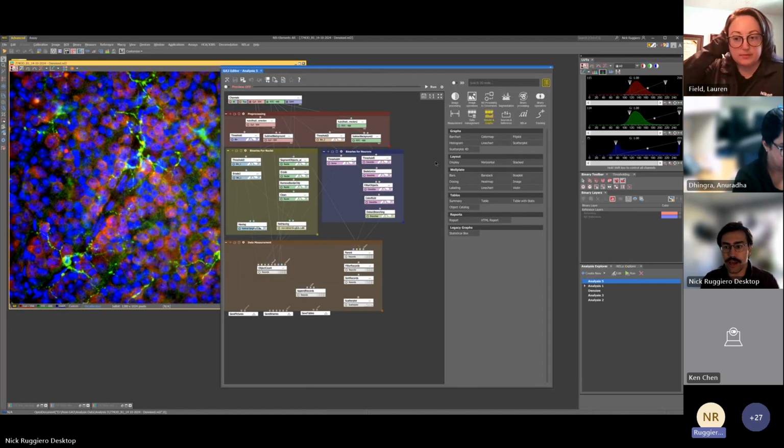So before we get too heavy into this, this is going to be the layout for anybody that's not familiar with Elements. I like to try and keep things pretty organized.